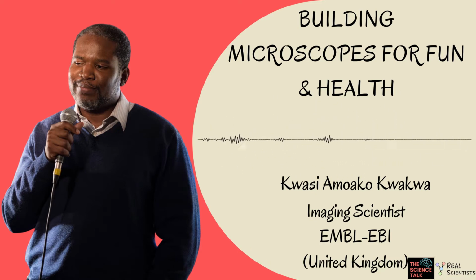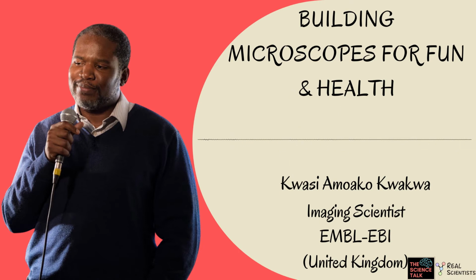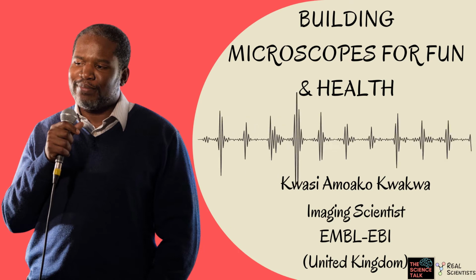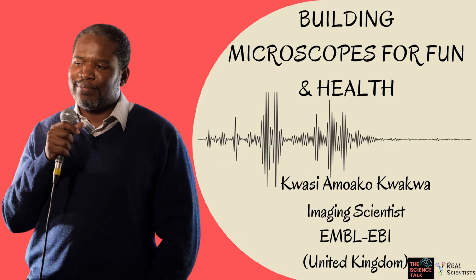Wow, that sounds super cool. So you must have super detailed images and super colorful images as well. Yes, it's good for pretty pictures. It's fine. Okay, super. So I'm assuming what you mentioned with the kidney slice could be any tissue slice, any organ slice, basically anything, right? Yeah. In the lab we have a bunch of collaborations with different labs looking at different kinds of human and animal biology. So people who are studying brains or kidneys or endometriums or feet, we look at all of it.